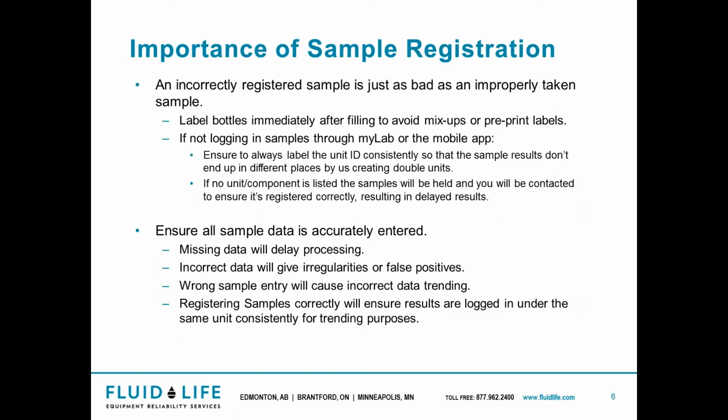As Jacqueline mentioned, my name is Drew McRae, and today we're going to be talking about sample registration. So we're going to get right into it. Some of the key points we're going to cover is sample registration. An incorrectly registered sample is just as bad as an improperly taken sample. It's really important that we pre-label our bottles, to make sure there's no mix-ups. Correctly filled out labels will really help in aiding faster processing with our customer care.